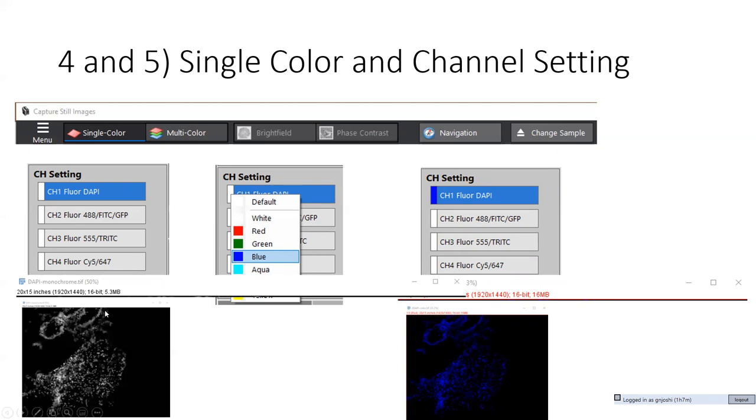If you look at the size of the image, you will see that this is about 5.3 MB, and this one, because it has three channels within it, is 16 MB. So sure, if it's a blue color, it's okay. You got red, green, and blue. You can ignore the red and green images and just work with the blue image. You can extract that.